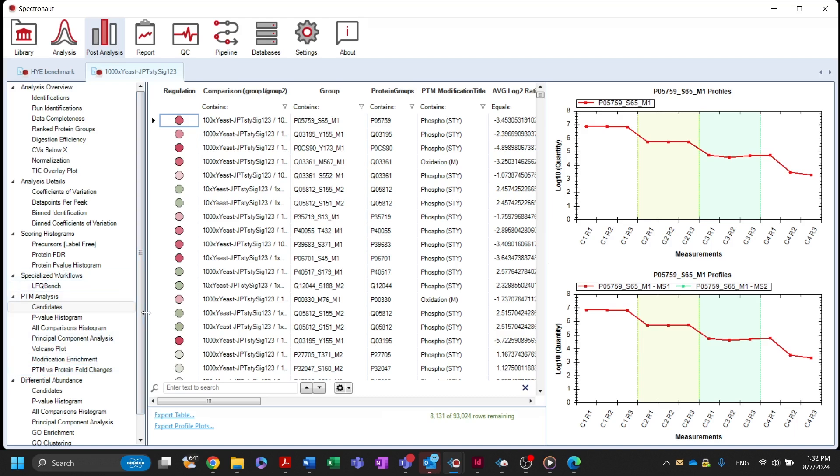The candidates table contains a list of differentially abundant modification sites with their corresponding log2 fold changes and Q-values. The identification key for the specific modification site and multiplicity can be found in the group column.